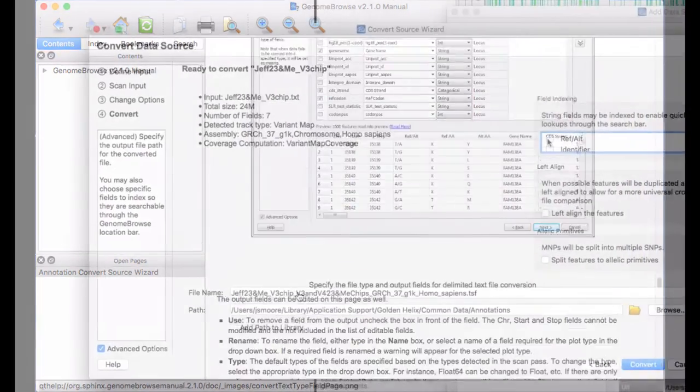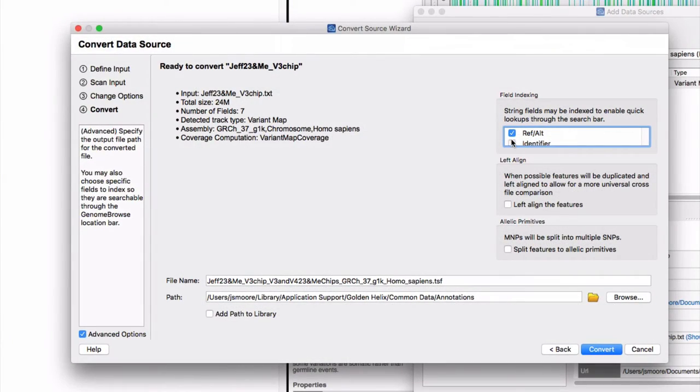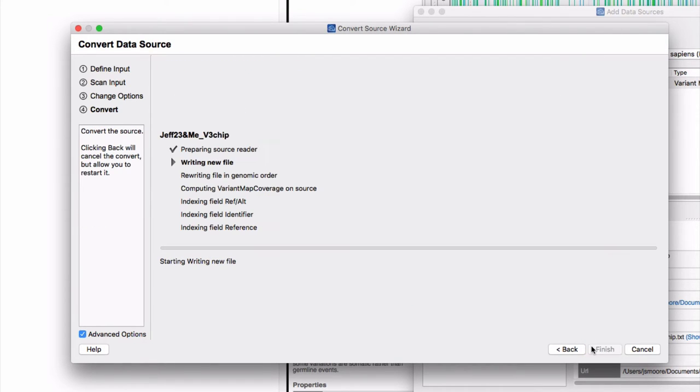Click all the field indexing boxes, so that the searches you will perform in Genome Browse will look through the imported data. Click the convert button.